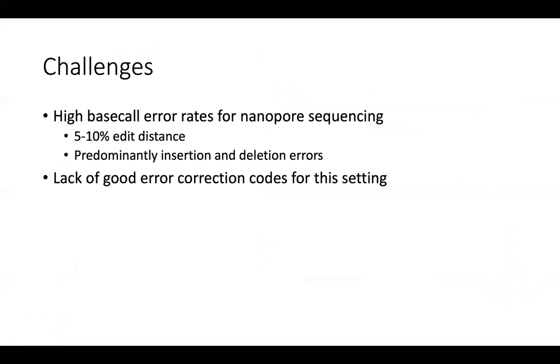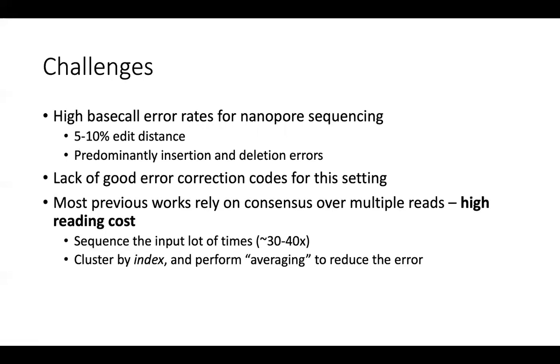There are a lot of challenges, especially with nanopore sequencing. The error rates are really high — five to ten percent — and they are insertion and deletion errors mostly, which makes it very difficult because there is a lack of good error correction codes for this setting, especially considering that we have very short sequences, so you can't use large block codes. Most previous works just do something called consensus, which means you read the sequence many times. You can cluster the sequences according to their index and perform some sort of averaging, which reduces the error. But this is very inefficient — similar to repetition coding, which we know is not the best way to do things.